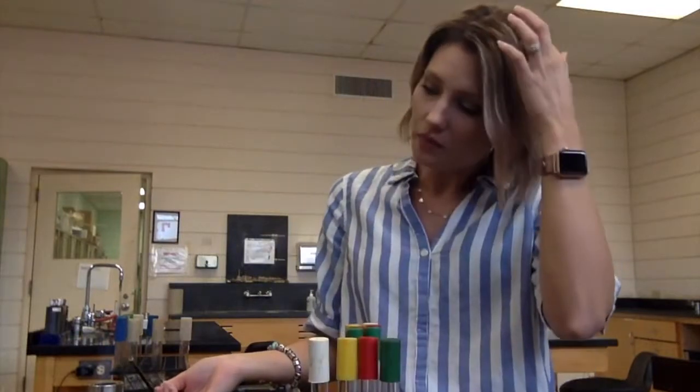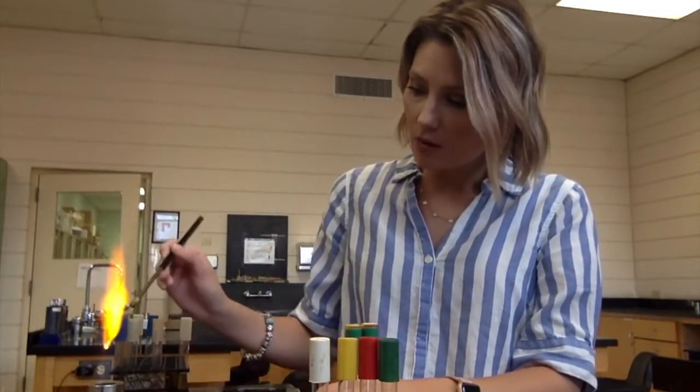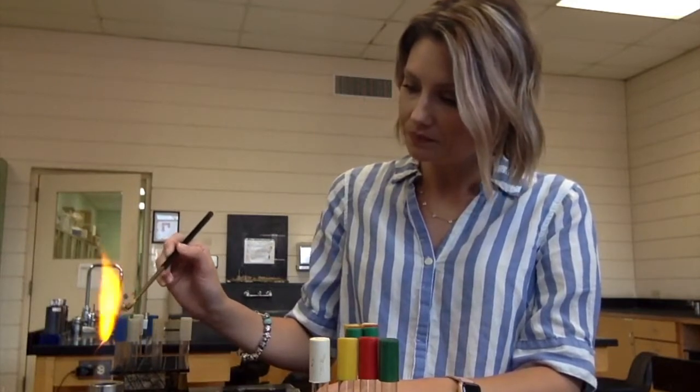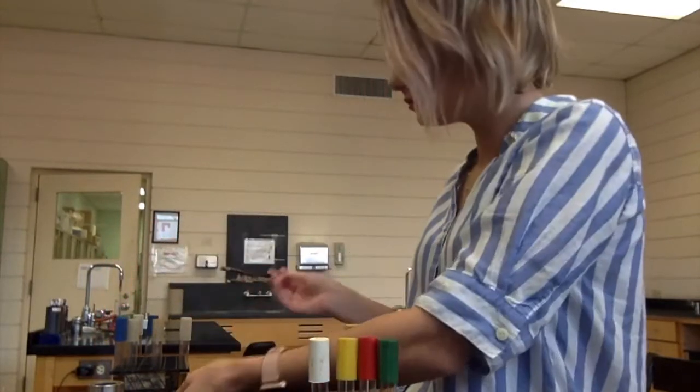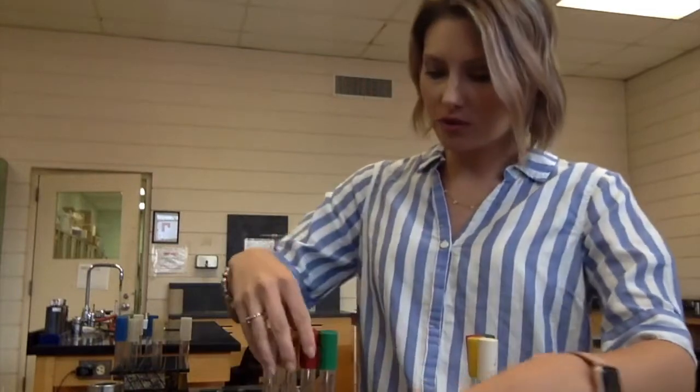Okay, so I inoculated my bacteria for my tubes. Now I'm going to go put them in the incubator. So let them incubate for 24 hours. When I come back to them, you will see that there's growth on the tubes.